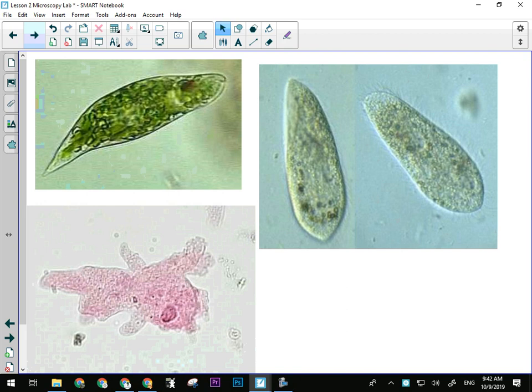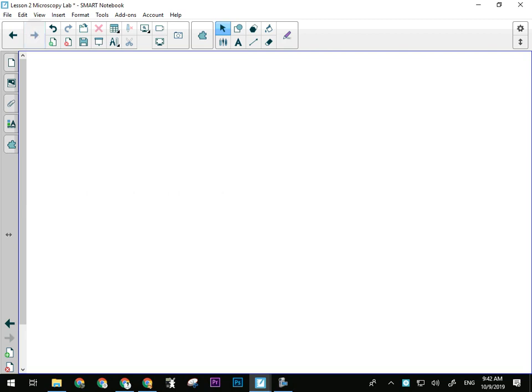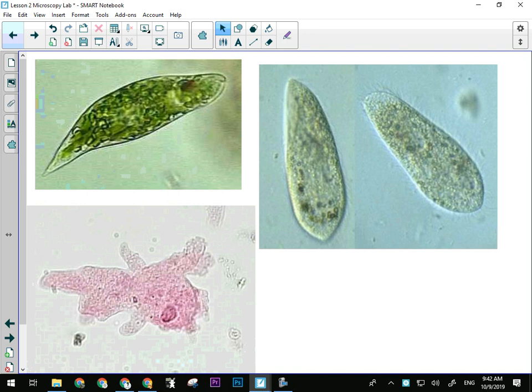So those are the 3 microorganisms you'll be looking at tomorrow under the microscope. But yeah, the euglena is a lot smaller than that. Yes, these are prepared slides. They've been sealed with resin for, probably longer than you've been alive for old slides. Okay. Questions on that for tomorrow?